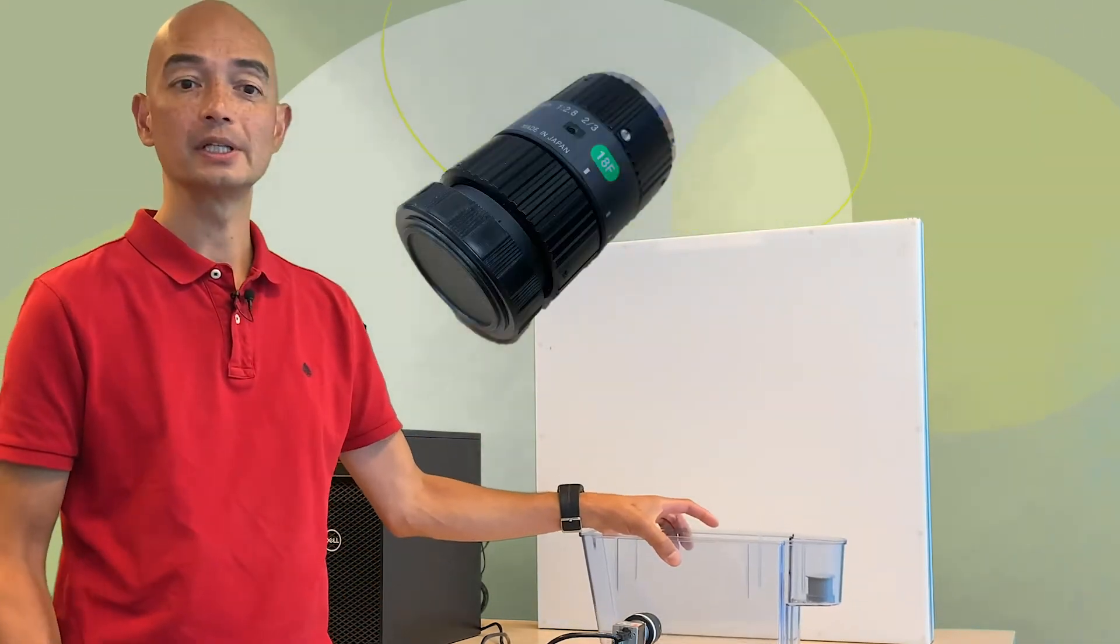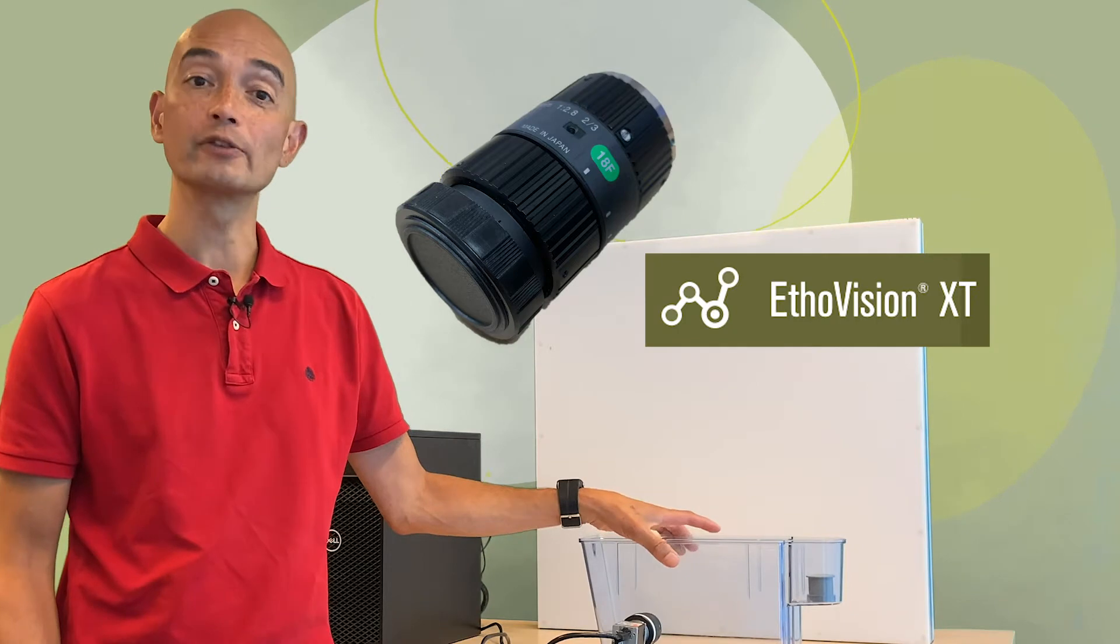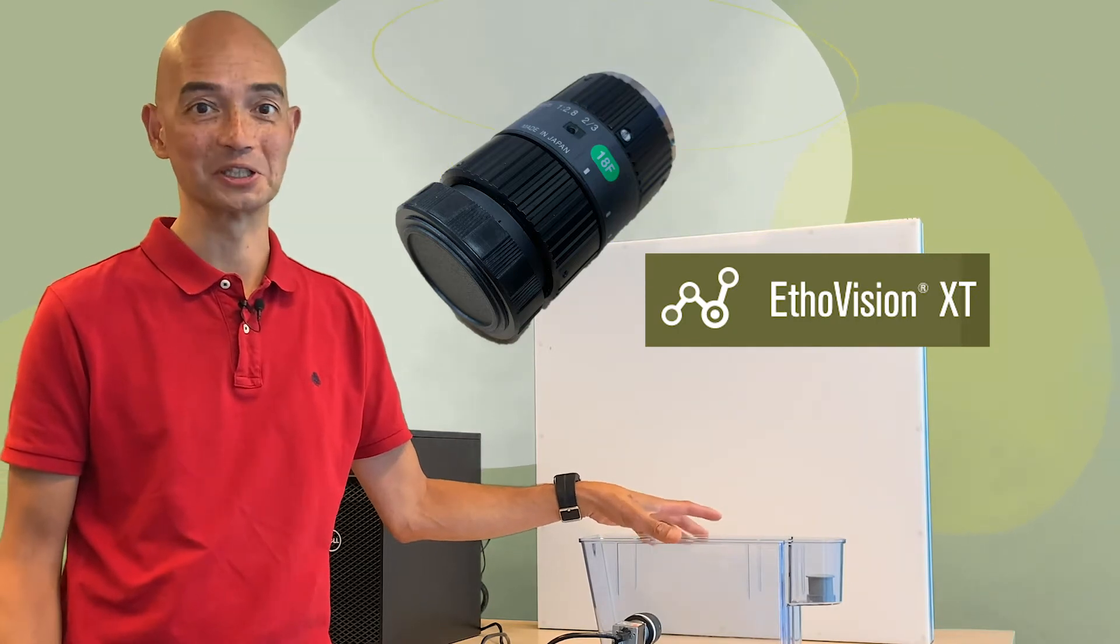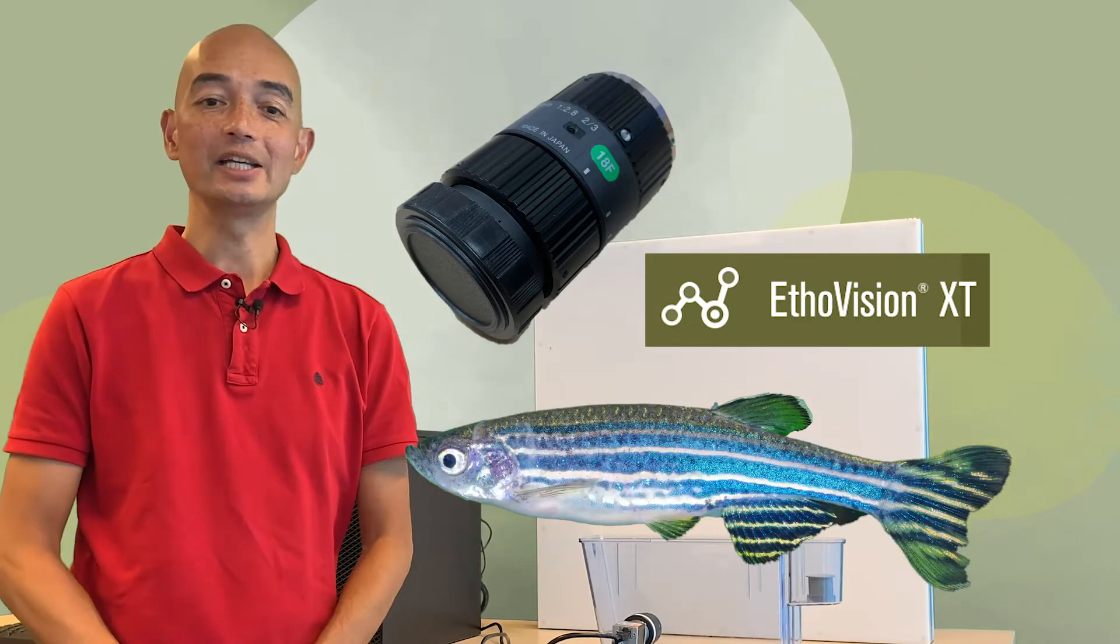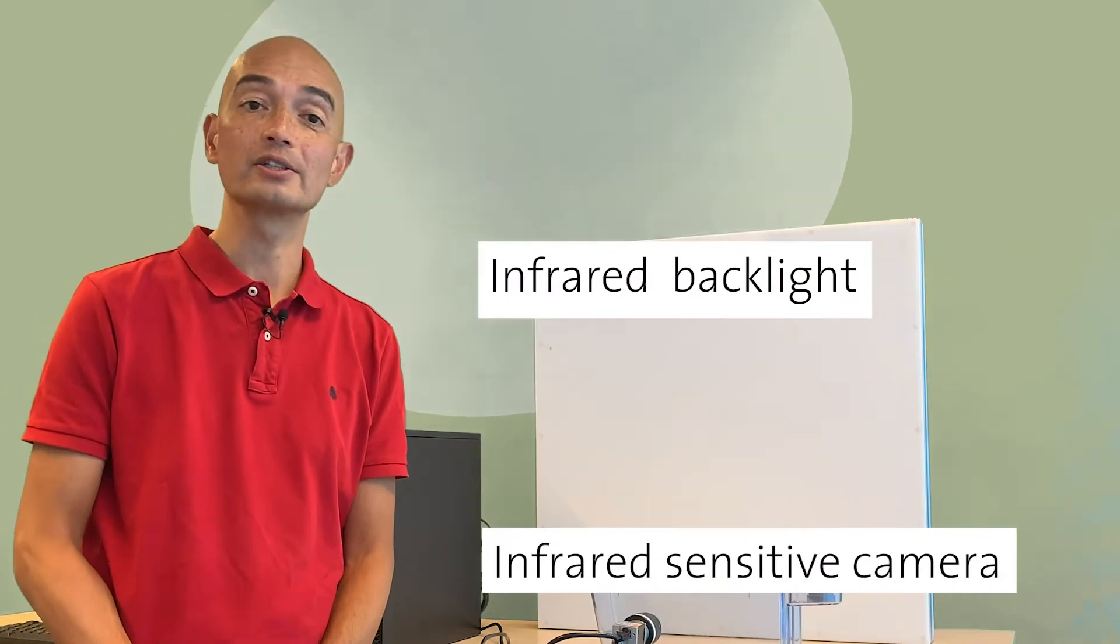Actually the test itself is pretty straightforward. It requires a simple tank, a video camera, the EthoVision XT software and of course zebrafish. It is recommended to use an IR backlight and an IR sensitive camera.